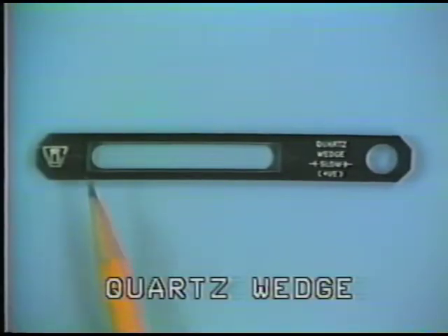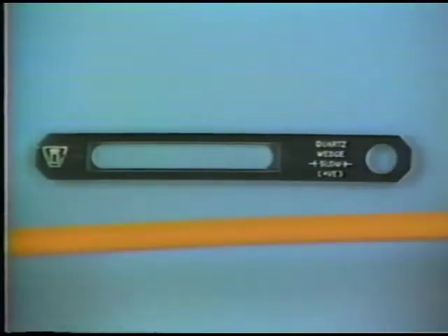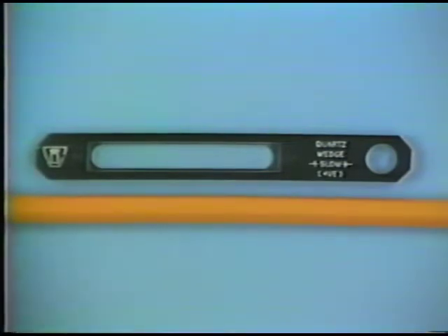Now, a third kind of accessory plate is called a quartz wedge. See, it looks a little bit different than the gypsum and mica plate. It has a very elongated piece of quartz located here, which is very thin at one edge and very thick at the other edge. And this is operated in the same way. It's slid into the accessory slot of the microscope. Another thing to notice about this particular quartz wedge is that the slow direction on this quartz wedge is indicated to be along the direction of the quartz. That is, the slow direction goes along the quartz wedge.